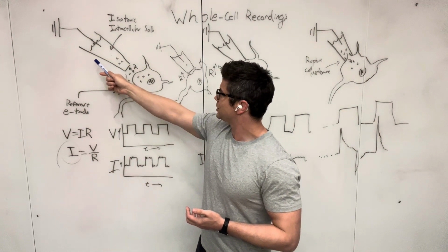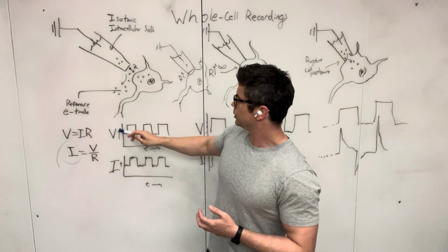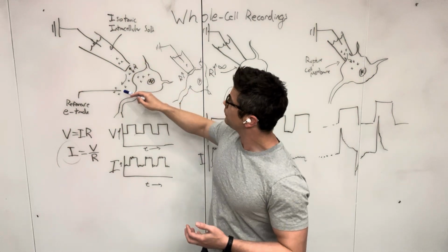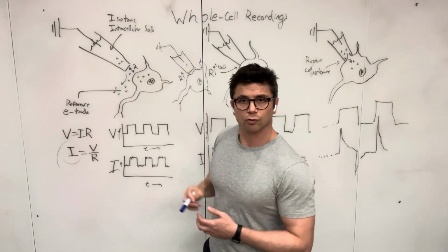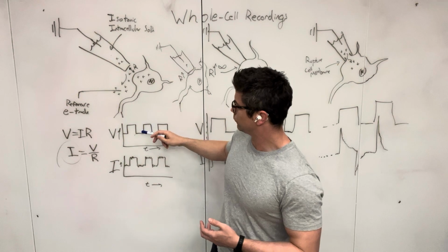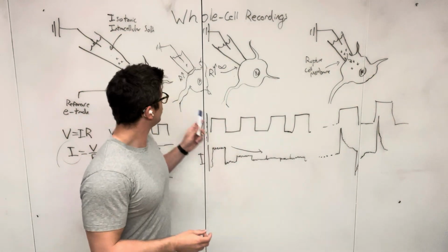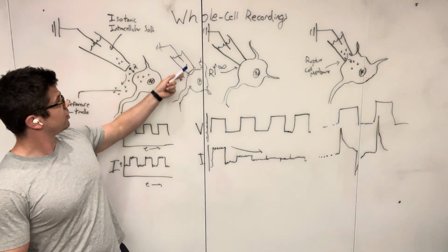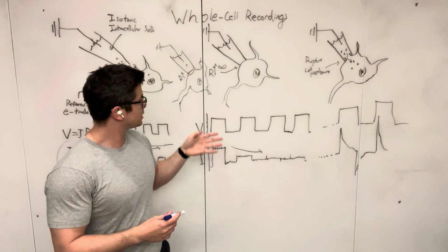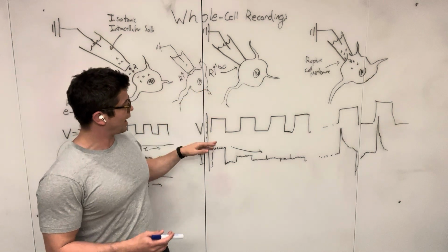As you get your micropipette very close to a neuron, you start doing these voltage steps with your electrode and measuring the current generated. If there's a free flow of ions between your recording pipette and the reference electrode, you're going to get a one-to-one correlation between the voltage you change and the current that you record, right? But as you get really close to a neuron, those ions have trouble getting out from between this little space. So as you get really close, the current generated from each voltage step actually goes down.